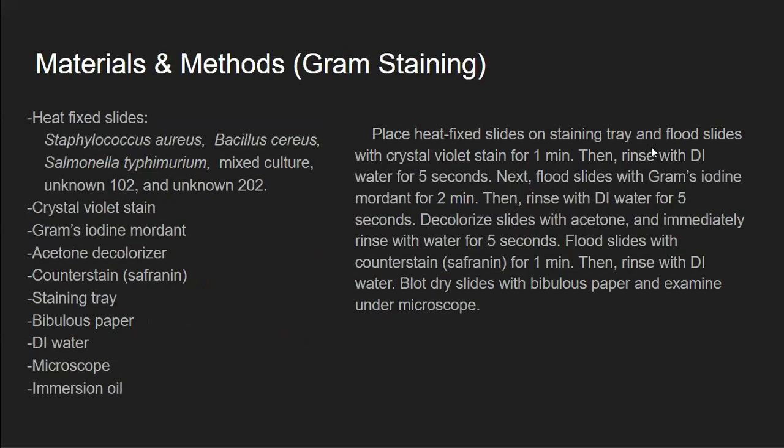The materials and methods. These are the materials. Place the heat fix slides on staining tray and flood slides with crystal violet stain for 1 minute. Then rinse with deionized water for 5 seconds. Next, flood slides with gram's iodine mordant for 2 minutes.